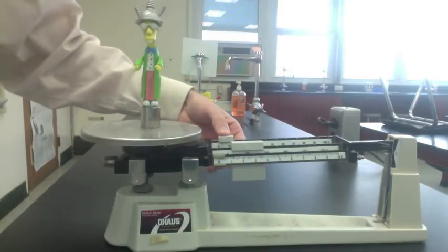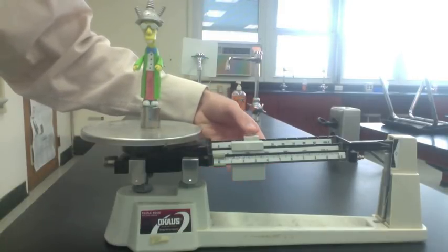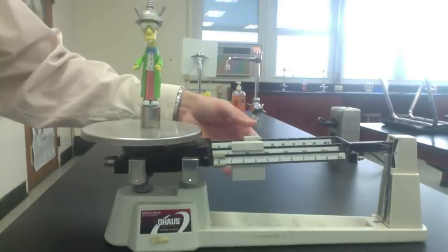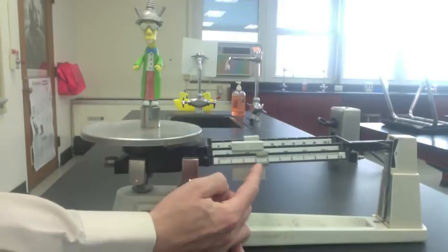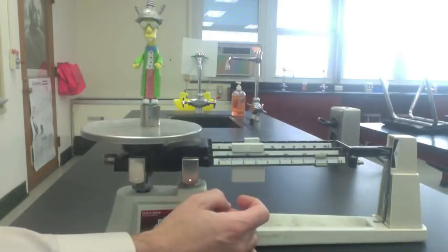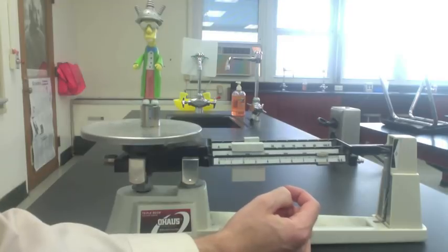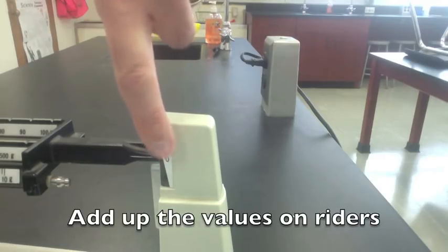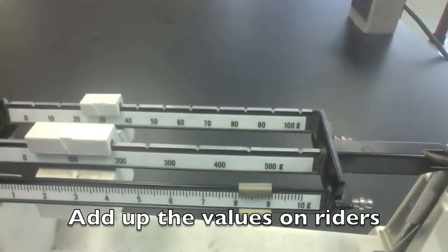Now try the tens rider. Move it out one click at a time until the pointer drops below zero, then move it back one click. Finally, slide the smallest rider out a little bit at a time until the pointer just balances. With the scale in balance, it's time to add up each rider. Looks like 138.6 grams.